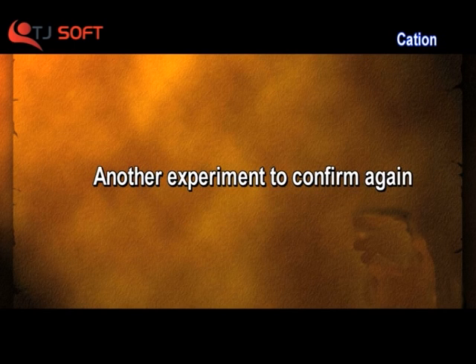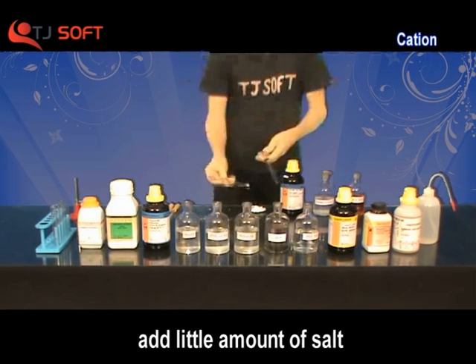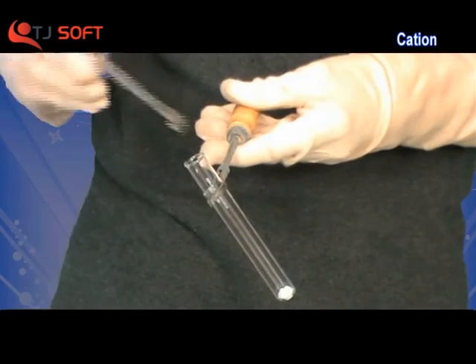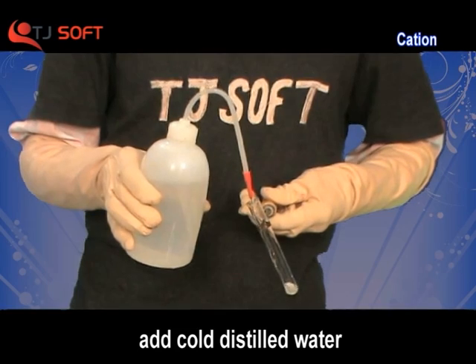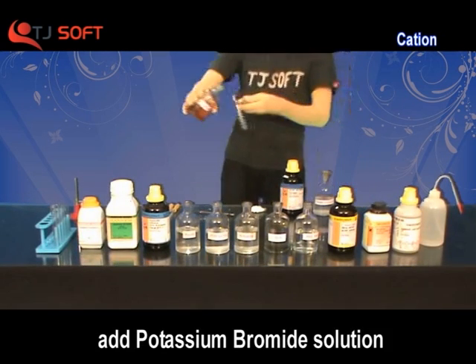We have another experiment to confirm it again — the action of potassium bromide solution. Take a test tube. Add a little amount of salt with the help of a spatula and add cold distilled water. Then add potassium bromide solution to it.